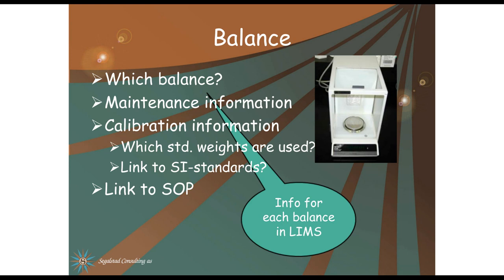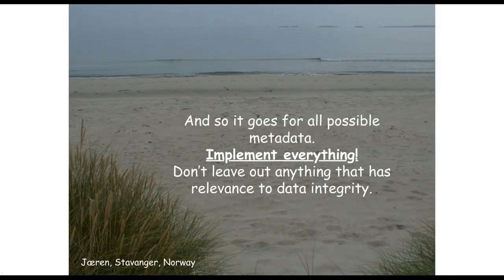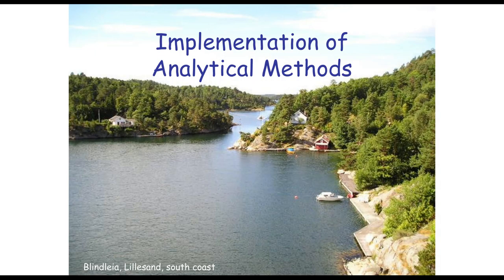Now we can add the instrument, this specific instrument, to the weight data we receive when weighing the sample. The previous balance logbook is now in LIMS and is available at our fingertips, ALCOA-plus. And so it goes for all possible metadata. Implement everything, don't leave anything out that has relevance to data integrity.